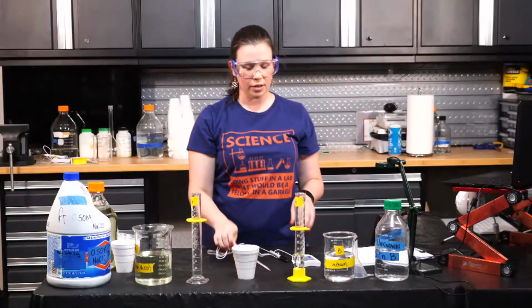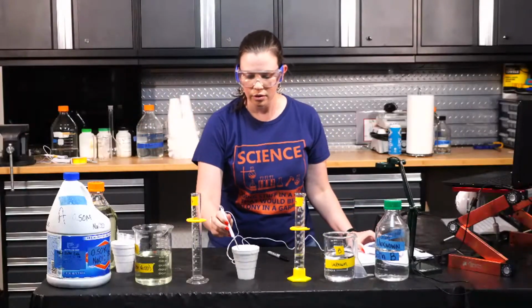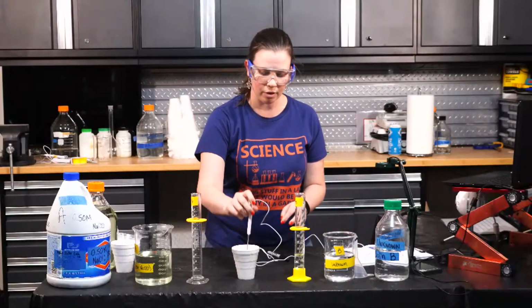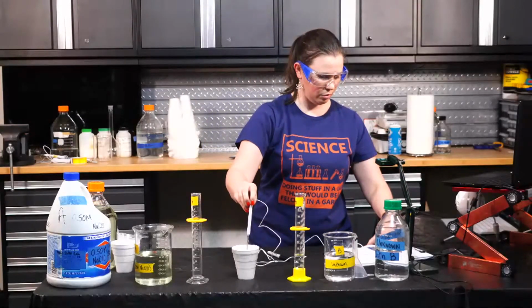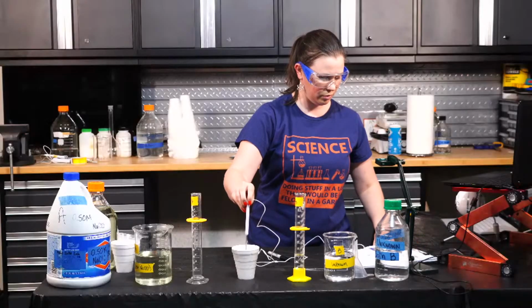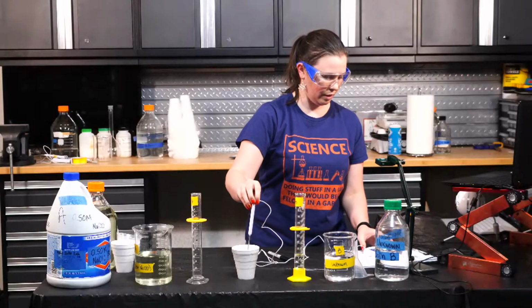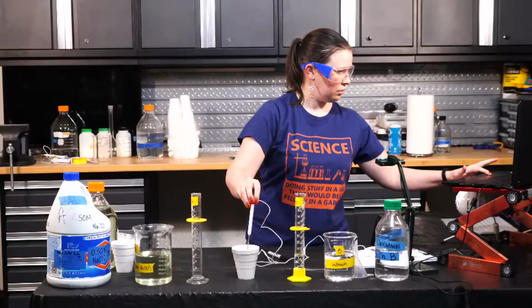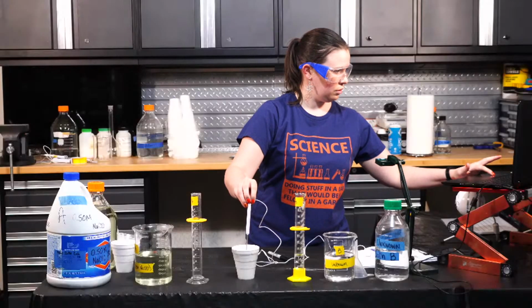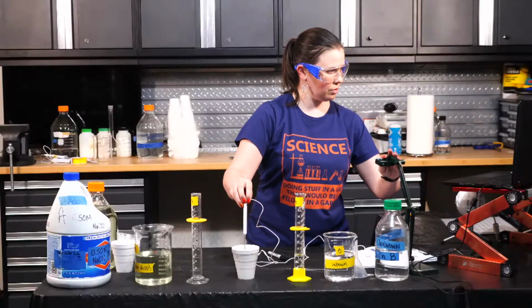All right, and when I do, I want to see what the actual temperature is. So I've got my probe, and if anyone's interested, I will show this on the dot cam in Zoom. I'll also read it out loud, of course, because I know a lot of you don't want to be bouncing in and out of breakout rooms. So there's the dot cam, just in case anybody wants to come see it.